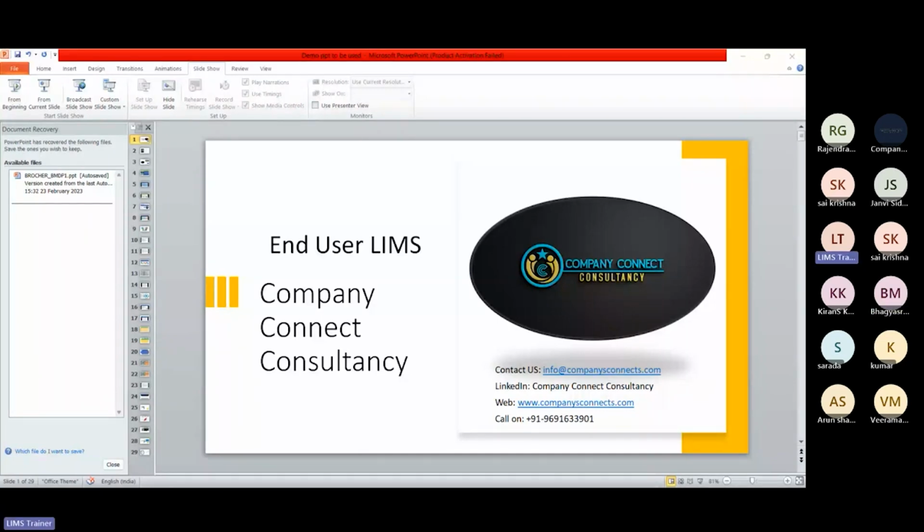Okay, okay. So this LIMS software is provided by many of the IT companies. For example, Caliber LIMS is there, Labware LIMS is there, and there are many more. But the basic idea behind all this software is the same. If you understand the terminology, like integration, sample management, data management, then administration, if you understand the basics, you will be eligible to handle all of the LIMS softwares. So let's go ahead.